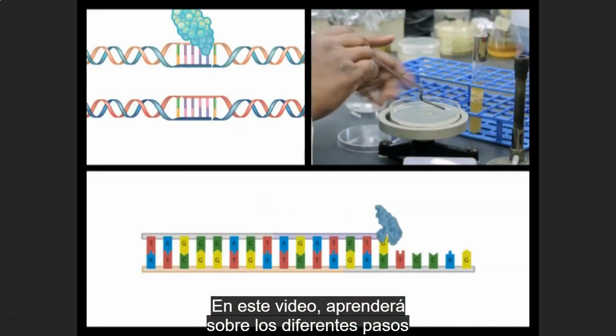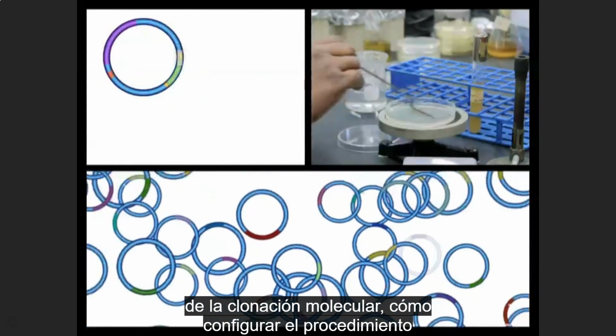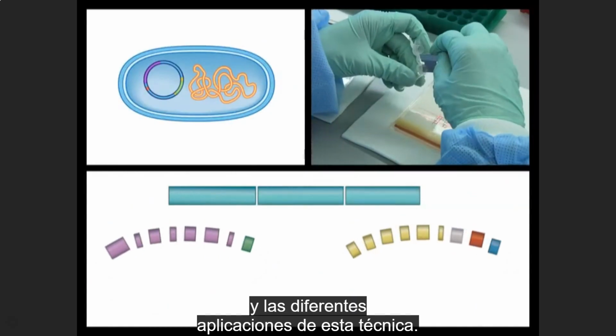In this video, you will learn about the different steps of molecular cloning, how to set up the procedure, and different applications of this technique.